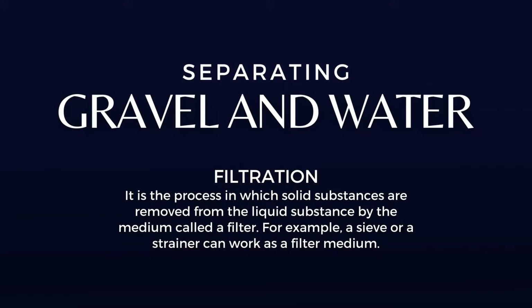Separating gravel and water. We can separate gravel and water by the methods of filtration and evaporation. For this experiment, we choose the filtration method. So, what is filtration? Filtration is the process in which solid substances are removed from the liquid substance by a medium called a filter. For example, a sieve or a strainer can work as a filter medium.